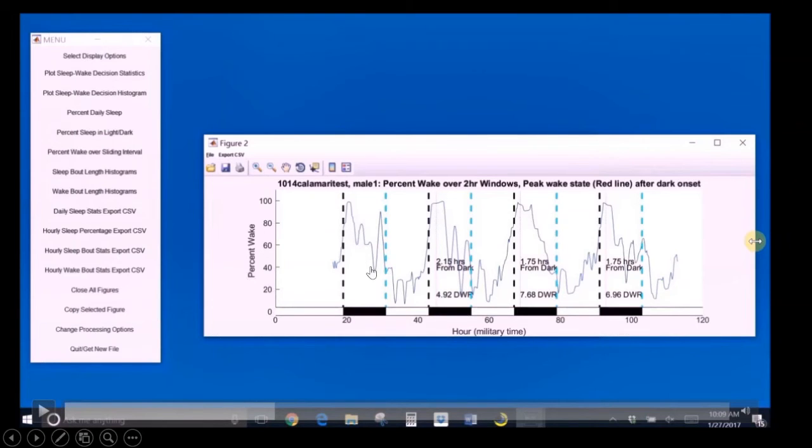And then mice do, again, sleep a fair bit in the night too, especially, say, black 6 mice. 3/4 in the night will have another, a little bit bigger sleep period. So this is a very typical pattern. But this is a nice 4-day look to see if everything's working well. This nice increase each dark period for 4 successive days. We have other variables looking at the dark-light ratio, to give you an idea of diurnal amplitude, kind of a circadian variable, and so on.